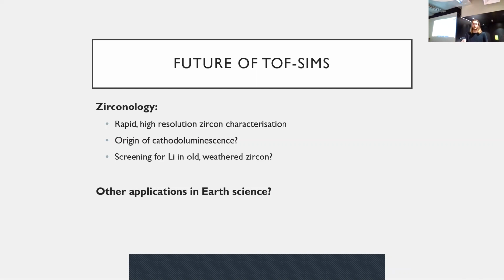Yes, it does, because the effectiveness of isotopes coming out of the pit decreases as you get deeper. But in our data reduction, that is all accounted for. Right, so it's normalized for that fractionation effect.